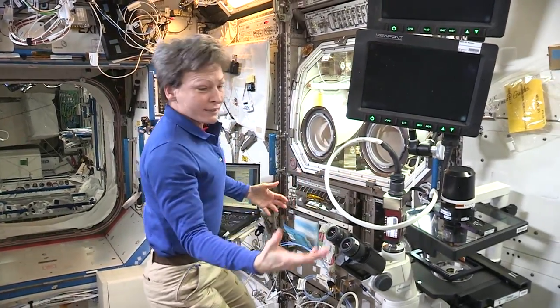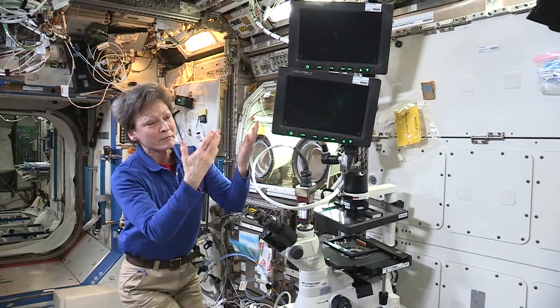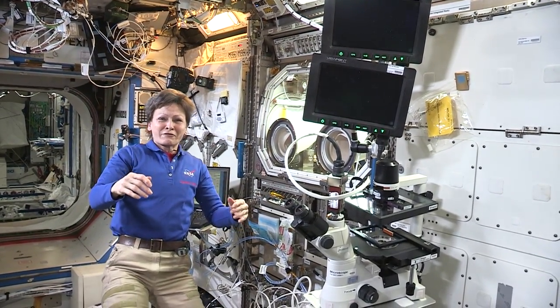The other thing attached to this is a microscope. We have a fantastic microscope with the capability to send videos and pictures down to the ground. Some on the ground have been looking at the structures that are forming differently here in zero gravity — that's why they're doing the research here, to see what new they can discover.